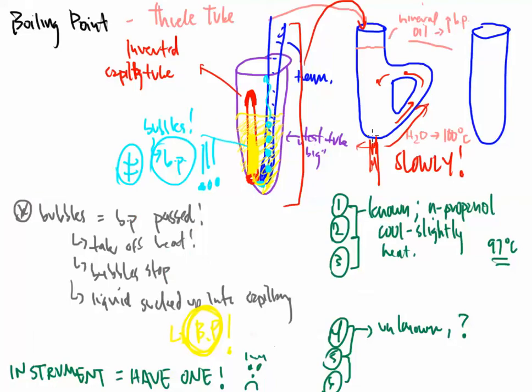So this is the setup for the boiling point. This is the pieces and parts that you need to do a boiling point. Very similar to a melting point system. There's hardly any difference at all. And you'll go into the lab, things will happen very smoothly, this process will go very quickly, and you'll be in and out within an hour to an hour and a half, hopefully. So that's the story with boiling point and how to use a Thiele tube to do a boiling point.